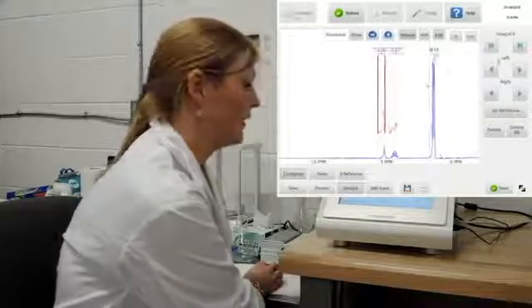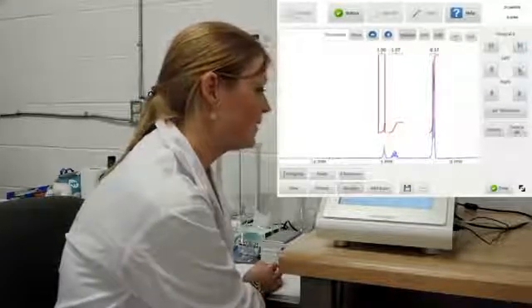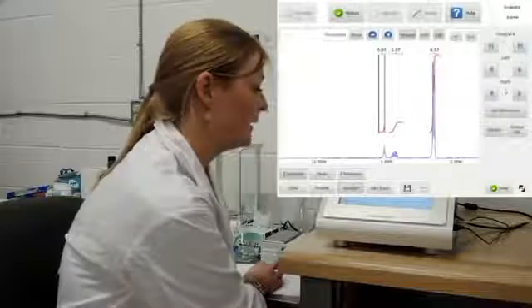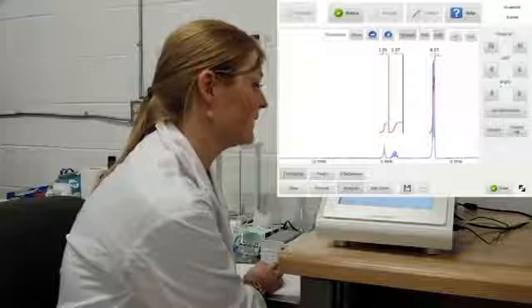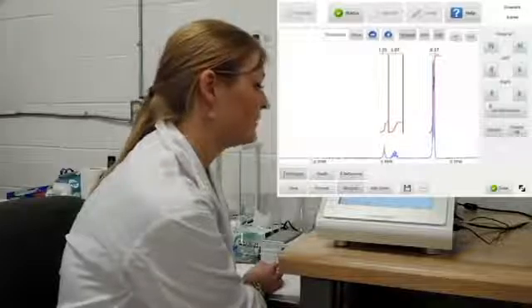Again, it's very easy to fix the bounds that you've set up. If you don't like the way that you set the boundaries, I can extend them or diminish them as I need on both bounds.